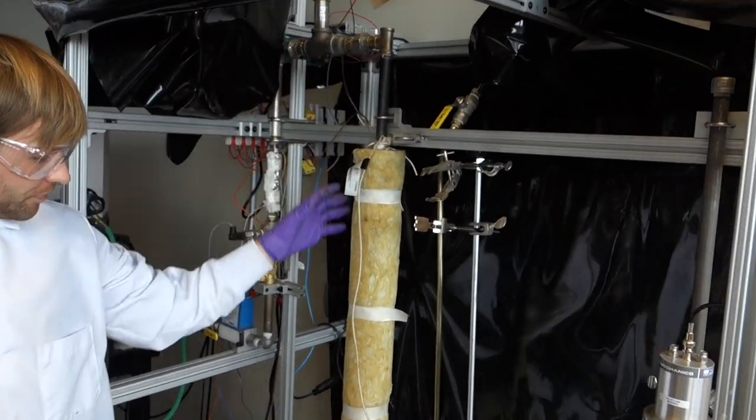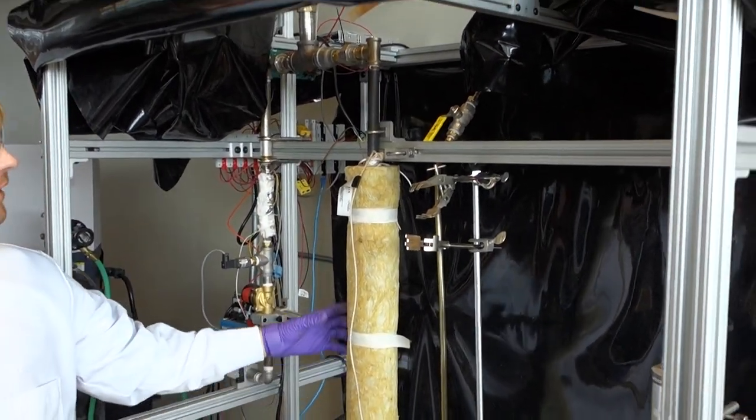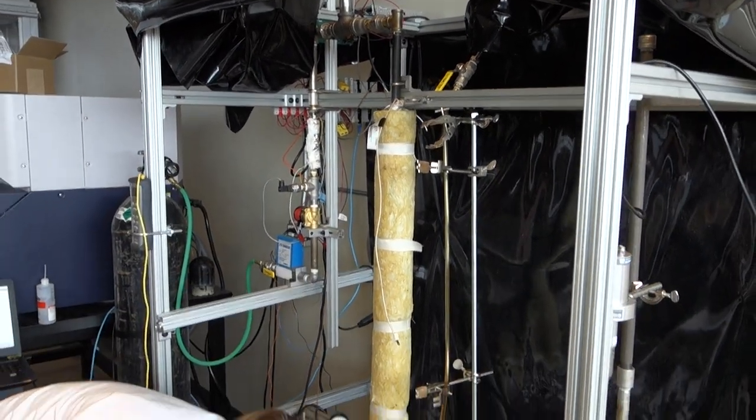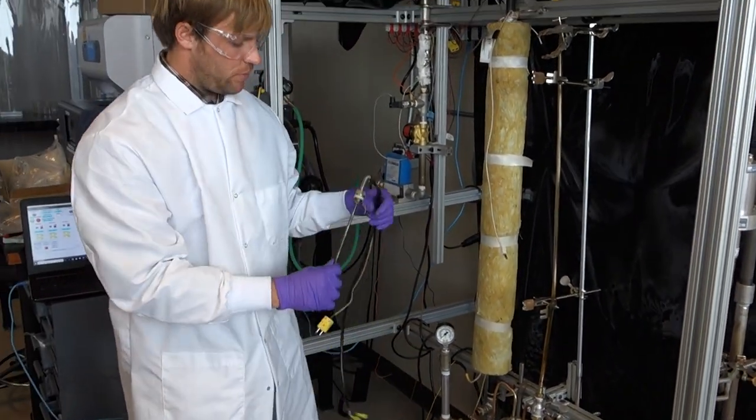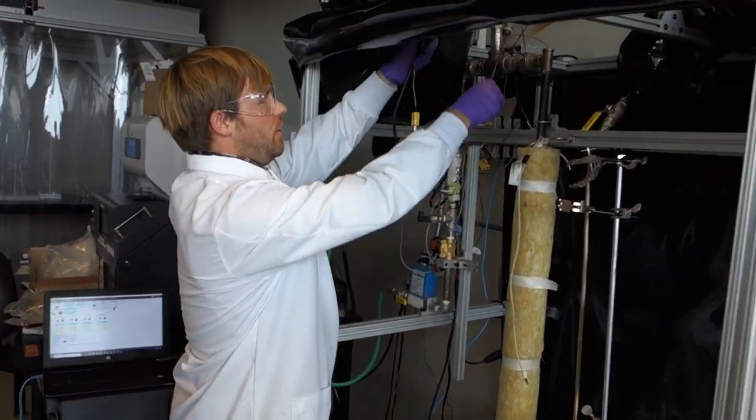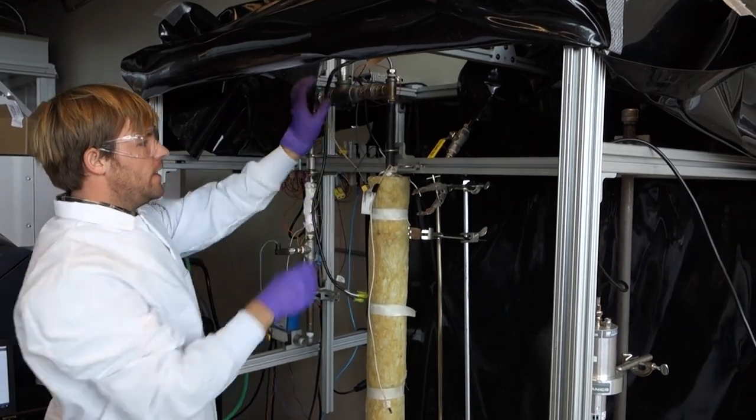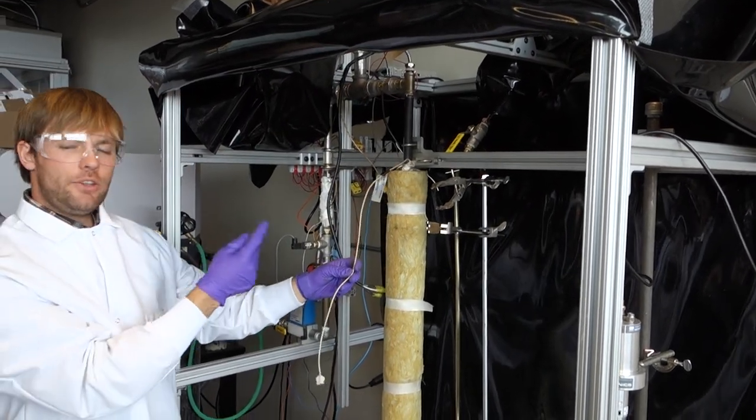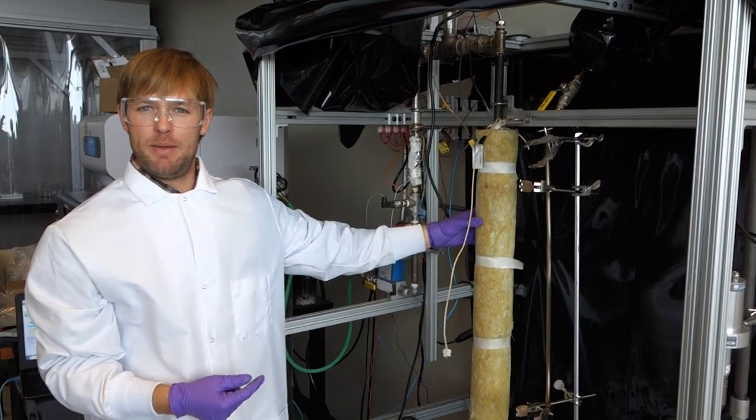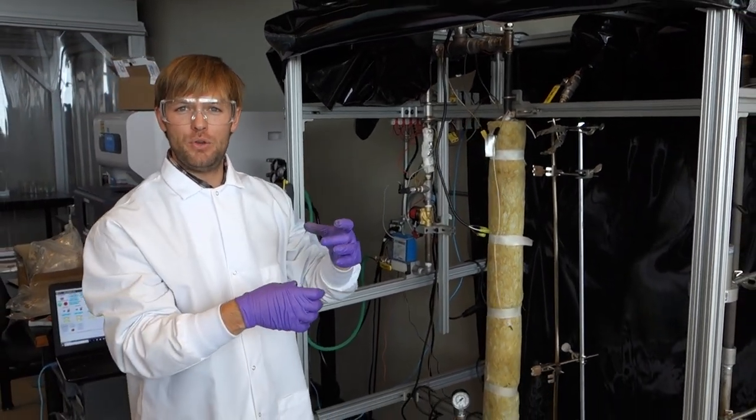This pipe here is our downfall reactor. It has an internal rod heater, which is a heated rod that goes on the inside of the pipe like this. It also has electric heating tape on the outside of the pipe, so it's heated from two different zones.